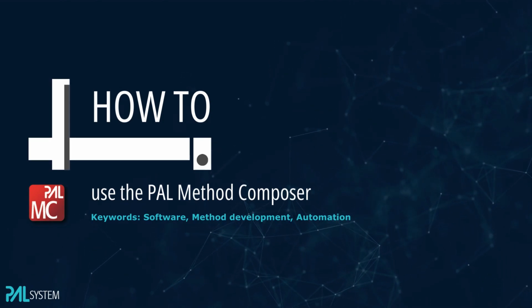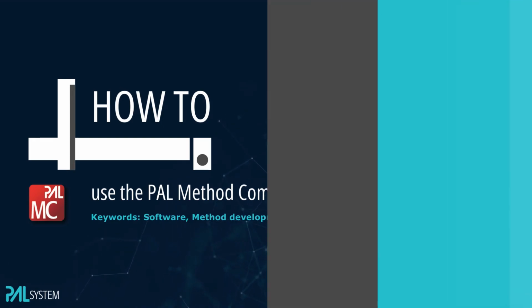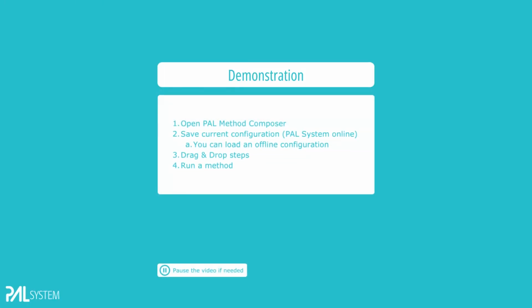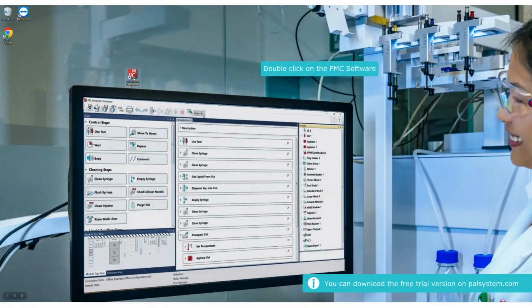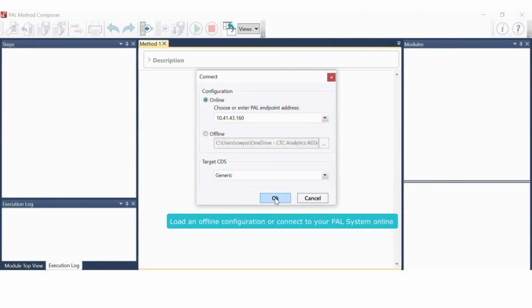In today's how-to video, we will show the use and some of the features of the PAL Method Composer software. The PMC is the software to write and directly test methods created for your PAL system. We start by opening the software. A free trial version is available on palsystem.com.